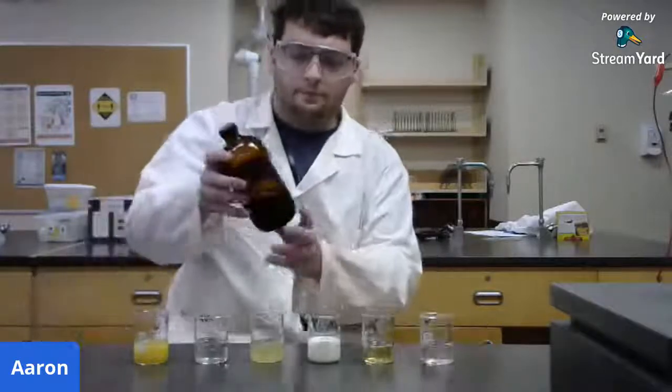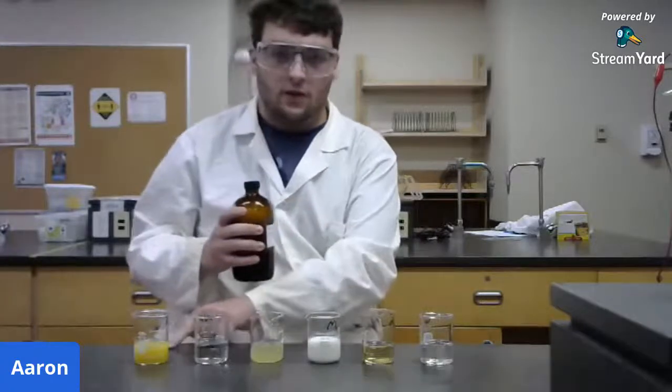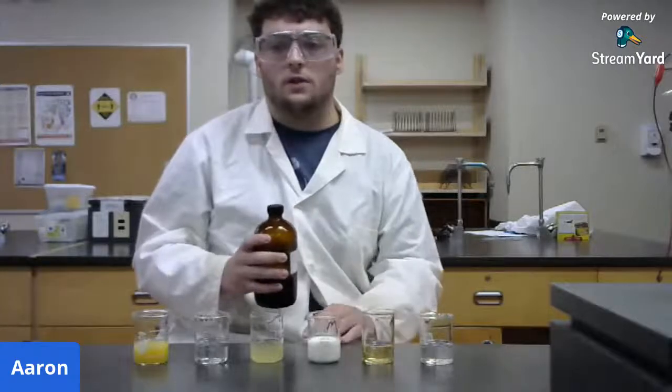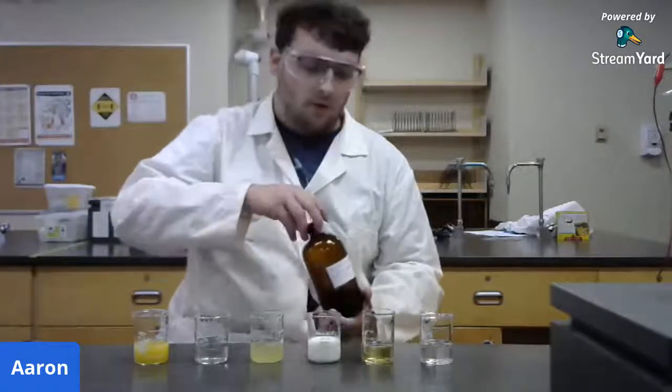So I'm going to take a little bit of the indicator and we're going to add it to each of these solutions, and we're going to see which one has the most vitamin C. If anyone has any guesses as to which one might have the most vitamin C, throw them in the chat now.